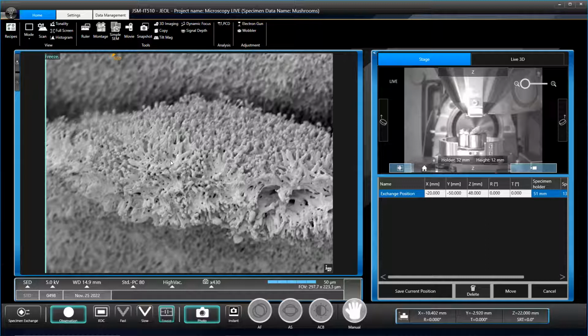When you take that photo, it gives you metadata. You get a little text file that goes along with it. It tells you the time, the date, all the conditions that you were using. So if you did want to reconstruct something or take basically the same picture again, you could mimic the actual conditions and everything that you were doing. It's a good way, if you're doing analysis over two or more days, to make sure that you're doing everything consistently. The images all have this emblazoned on the bottom of them as well.